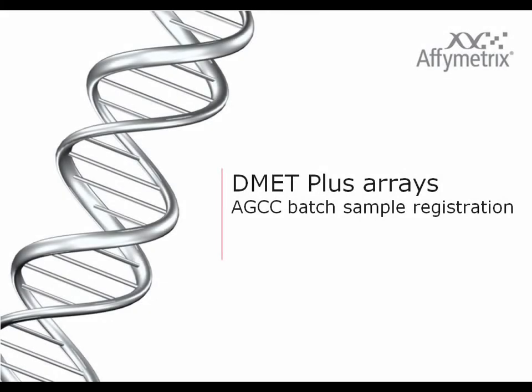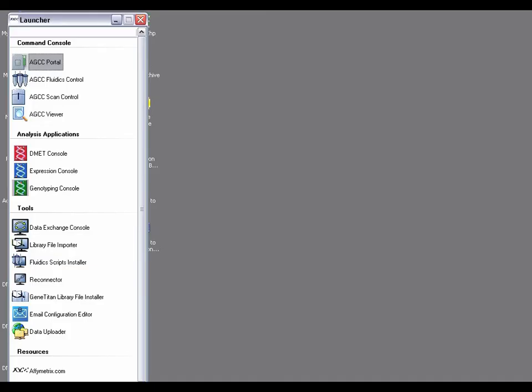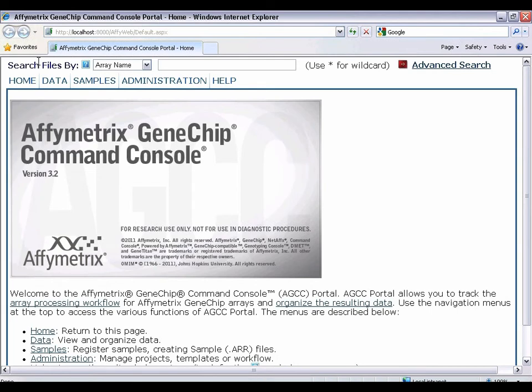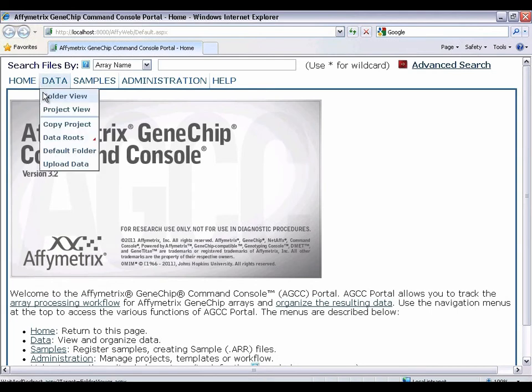This section describes batch registration of DMET plus arrays using Affymetrix GeneChip Command Console software. To batch register your DMET plus arrays, go to the AGCC portal.